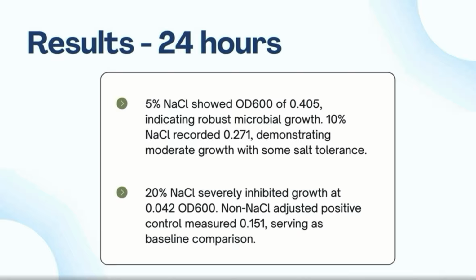The 20% sodium chloride environment, however, severely inhibited growth, remaining at a minimal OD 600 of just 0.042. For comparison, our non-sodium chloride adjusted positive control sat at a baseline reading of 0.151 at this 24-hour mark.